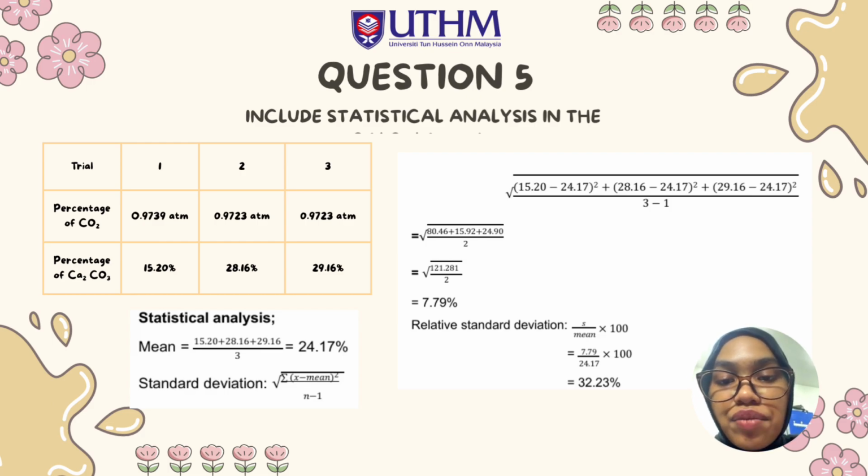Statistical analysis for the mean, we total all the percentages of CaCO3 divided by 3. We got 24.17%. For the standard deviation, we got 7.79%. And relative standard deviation, we got 32.23%.